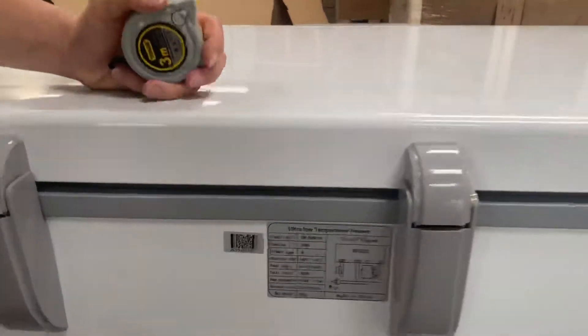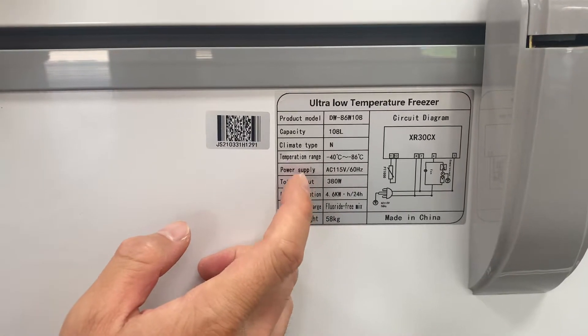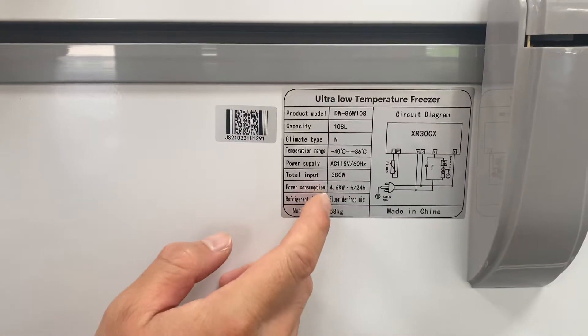Coming back here is a diagram: capacity is 108 liters, temperature ranging from negative 40 Celsius to negative 86 Celsius, and total input of 380 watts power consumption.